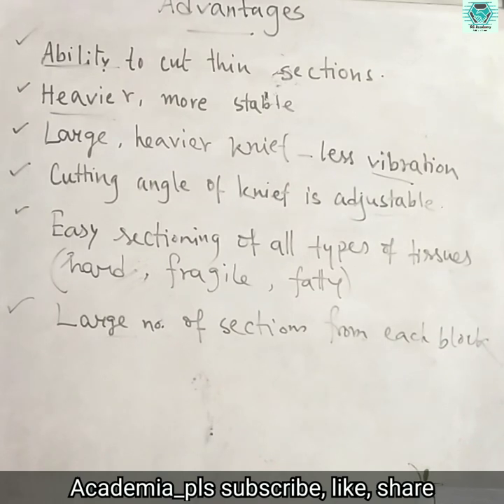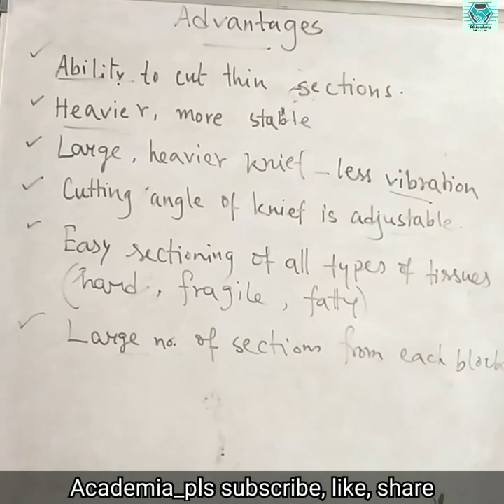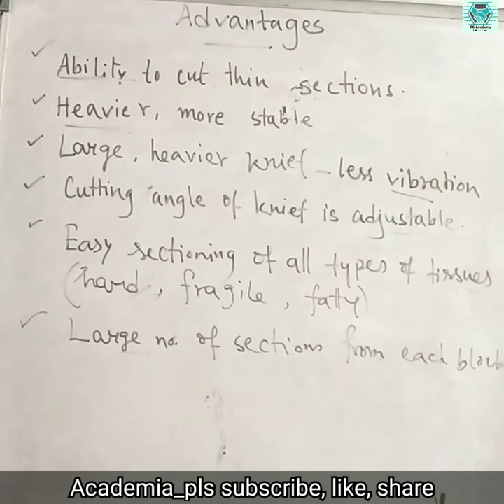Lots of advantages are there, but there are also some disadvantages. It doesn't allow serial cuts, which slows down the process. And one of the most important things is that the exposure of the blade can cause accidents. Nowadays we generally do not use knives, for our betterment. We use disposable blades, and if we don't take proper precautions, there will be chances of cuts.